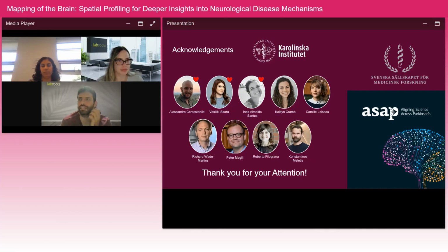The problem is also that sometimes if you go further with single cell studies, there might be some probes that do not work. So we checked one by one all the genes that we put on the list, that they have nice expression in the Allen Brain Atlas, for instance, because there are a few genes that you see as markers in single cell, but when you see the in situ, it doesn't look right. That can be many reasons. If you have fewer genes that express well, I think it's better than just going higher. So that was the reason.